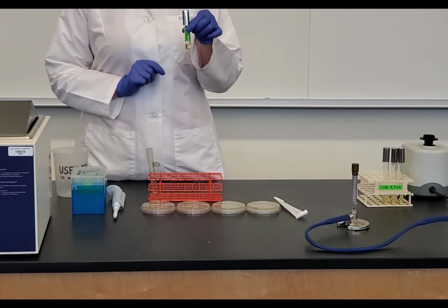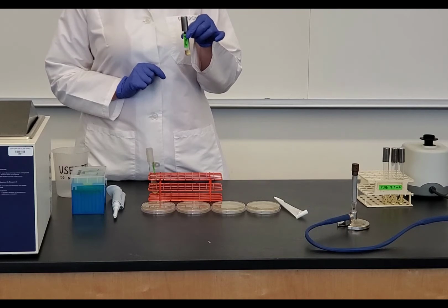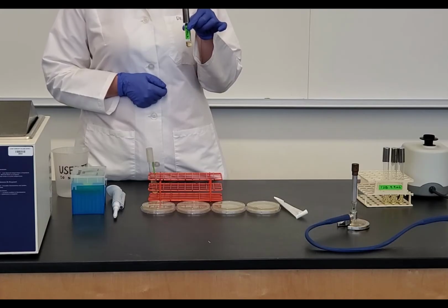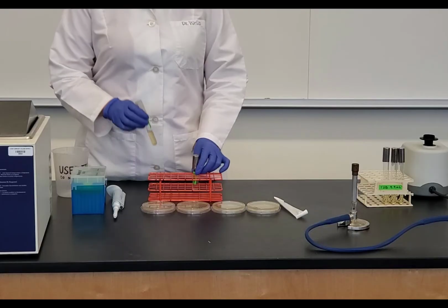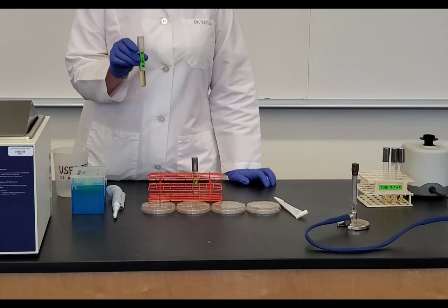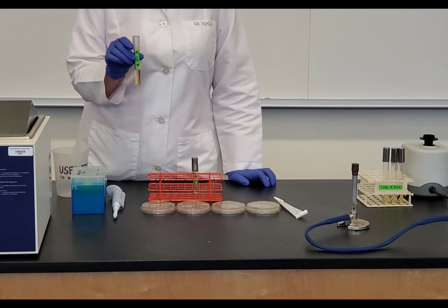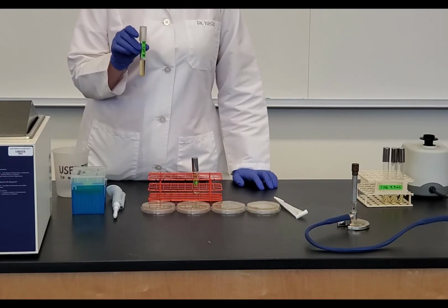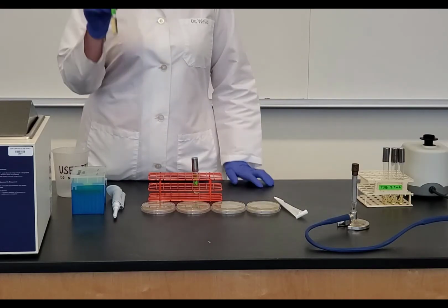Now, remember, the viruses are obligate intracellular parasites. They cannot reproduce outside of a host cell. So we can't simply just put this on a plate to determine the titer. It's not going to grow on its own. So in addition to having phage, we also have a strain of bacteria. We're using this E. coli strain B. And E. coli strain B is a strain of E. coli that is more susceptible to phage infection. And so this needs to be mixed with our phage in order for our phage to replicate and for us to determine the titer.